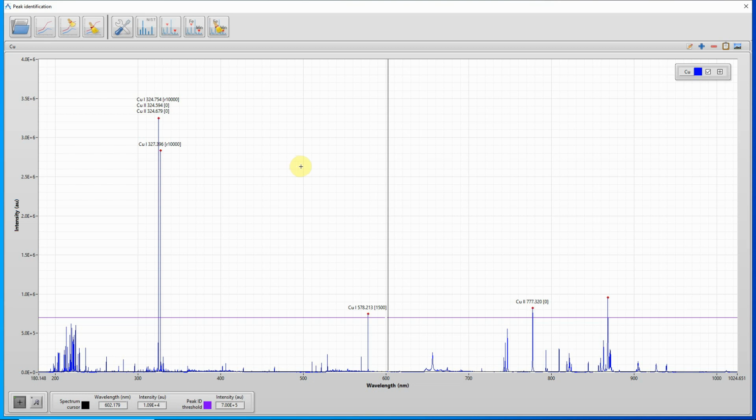Note that depending on the configuration settings, there may be more than one database emission line that matches each marked peak. In this case, the marked peak will be annotated with the details of all database lines that match it, for instance this peak here. If no database lines match the marked peak, then it will be left unannotated, like that one.